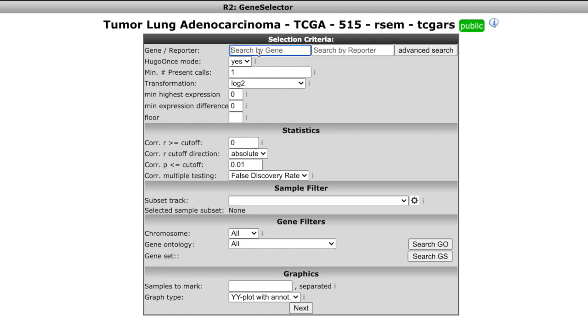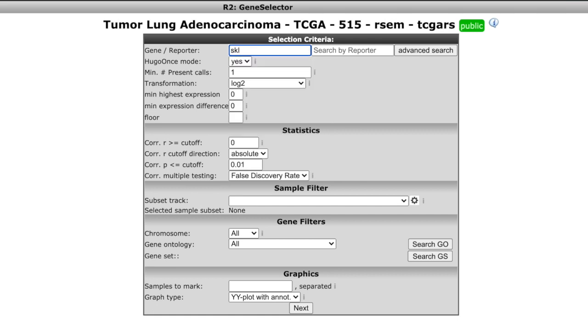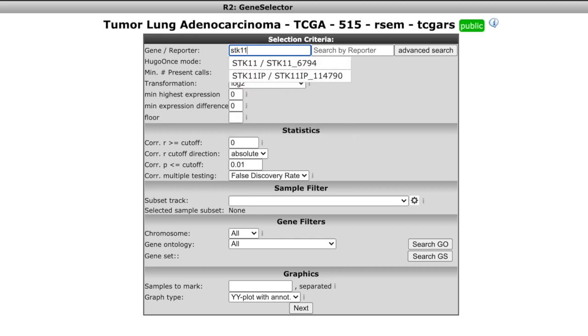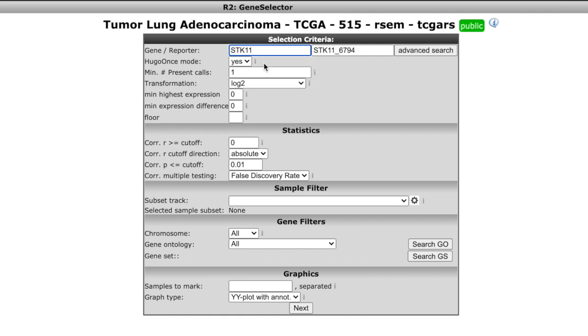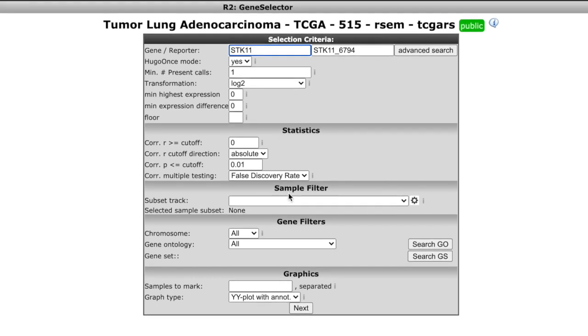I'm going to type in my gene. I'm going to say STK11. And as I type that, you'll see STK11. Click on that one, not the STK11 IP. That's a different gene. I'm going to leave everything the way it is right here. I'm just going to leave it the default. You don't have to mess with that.